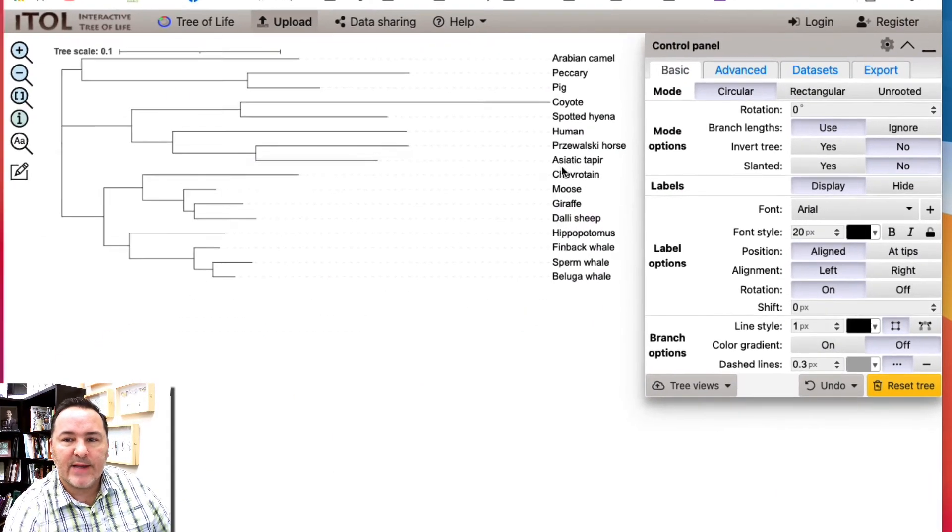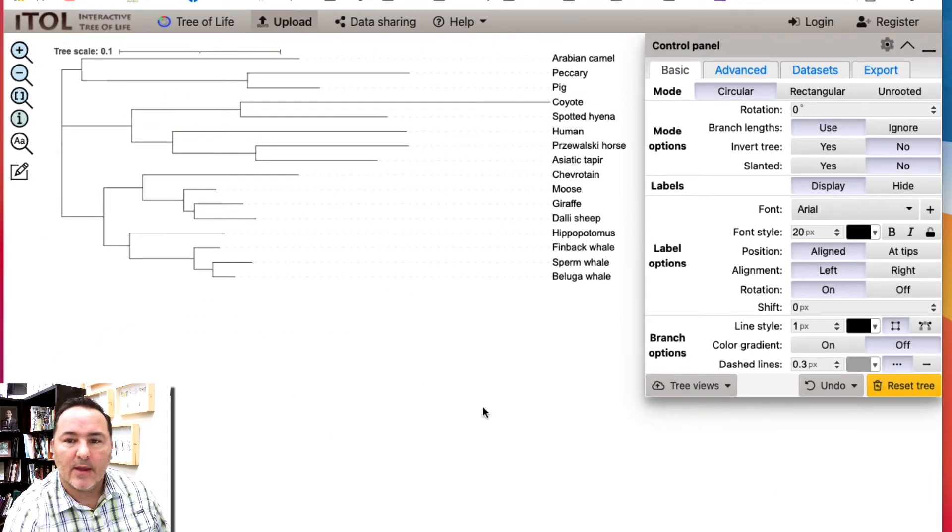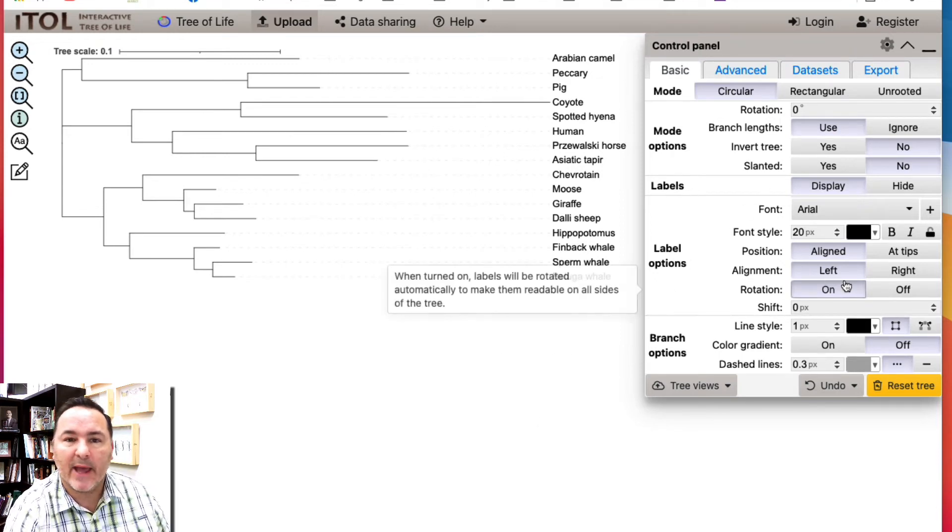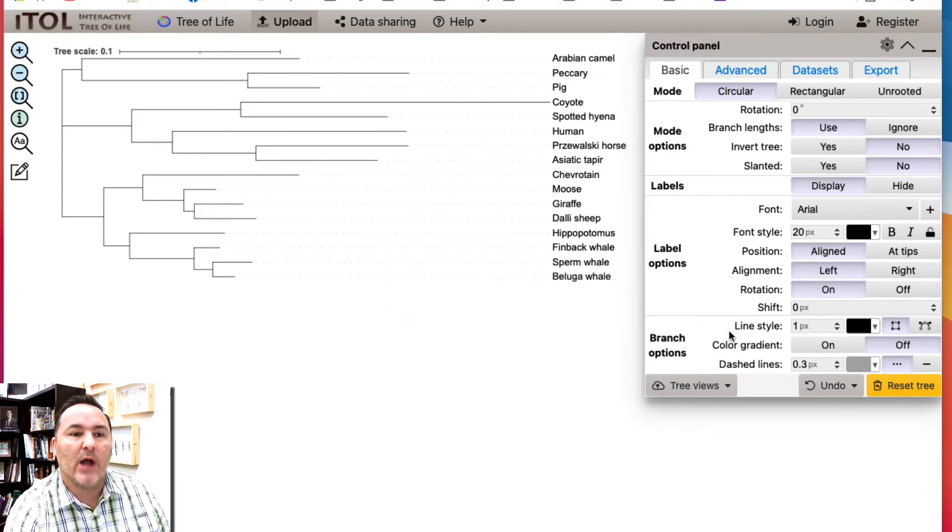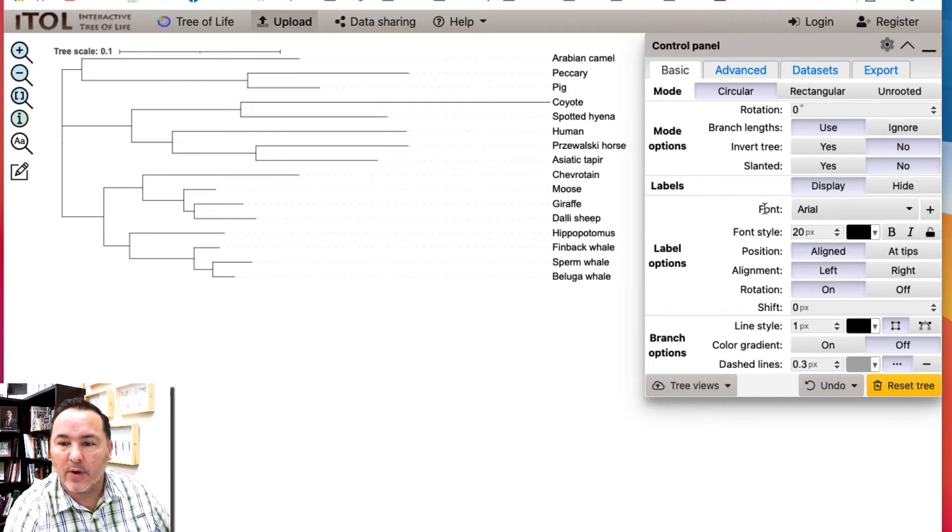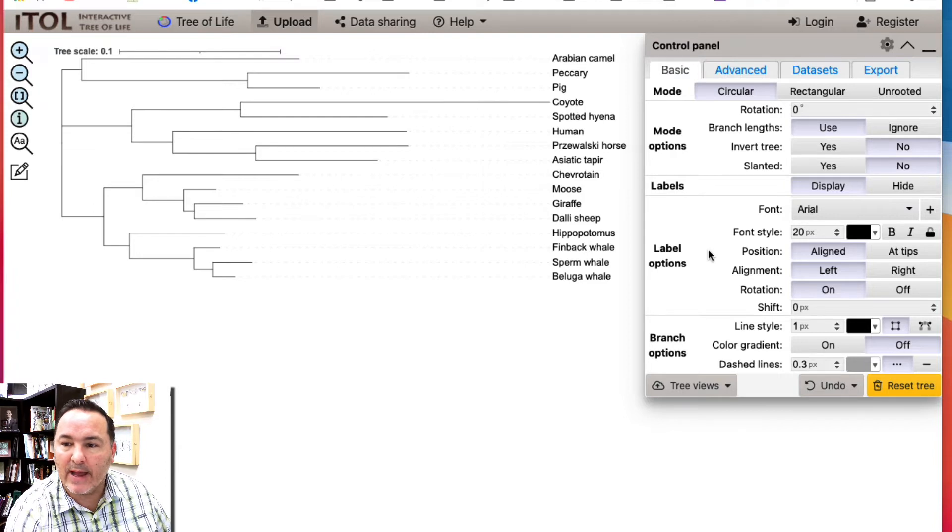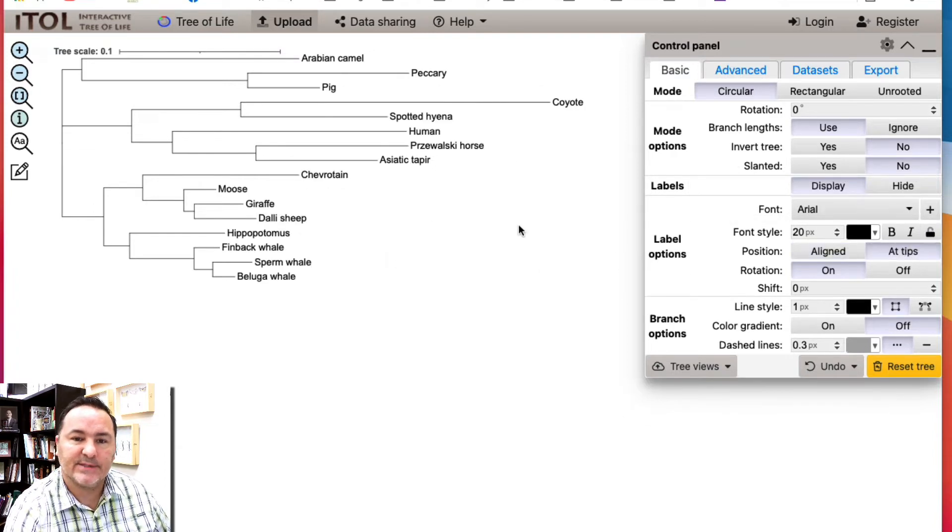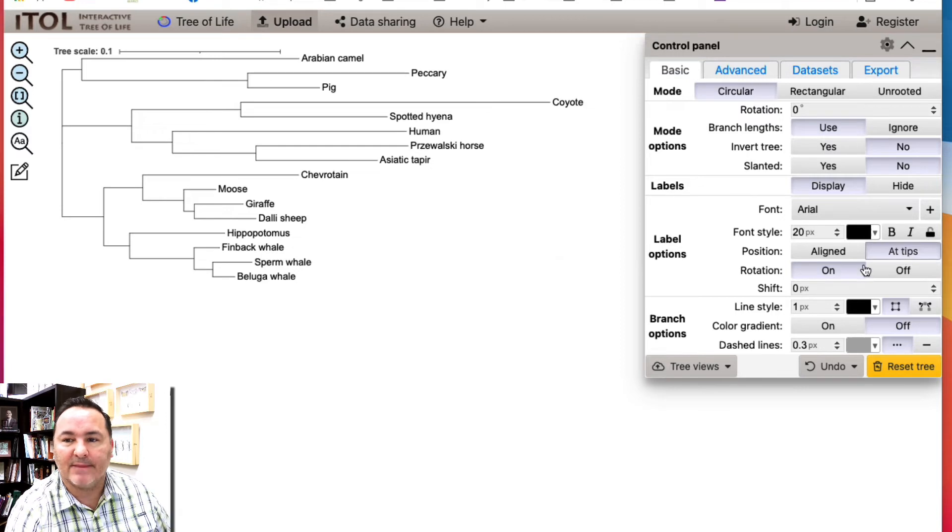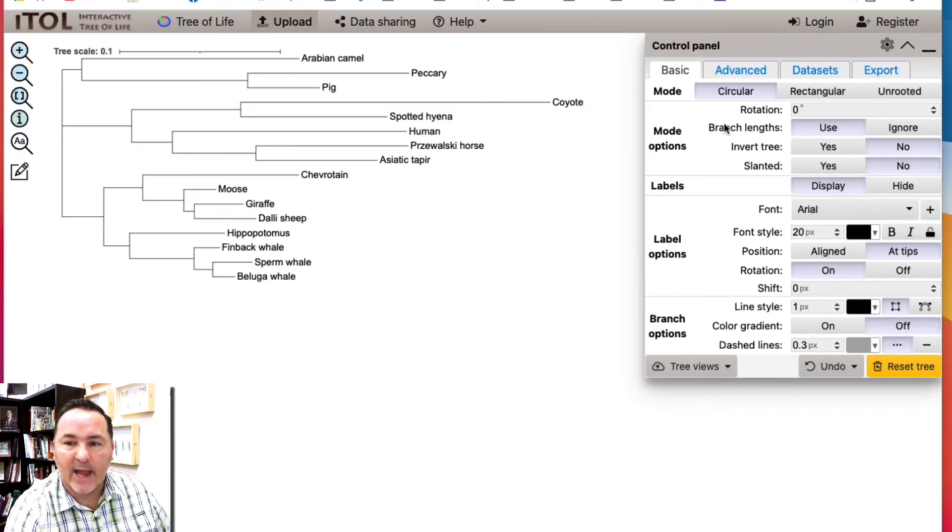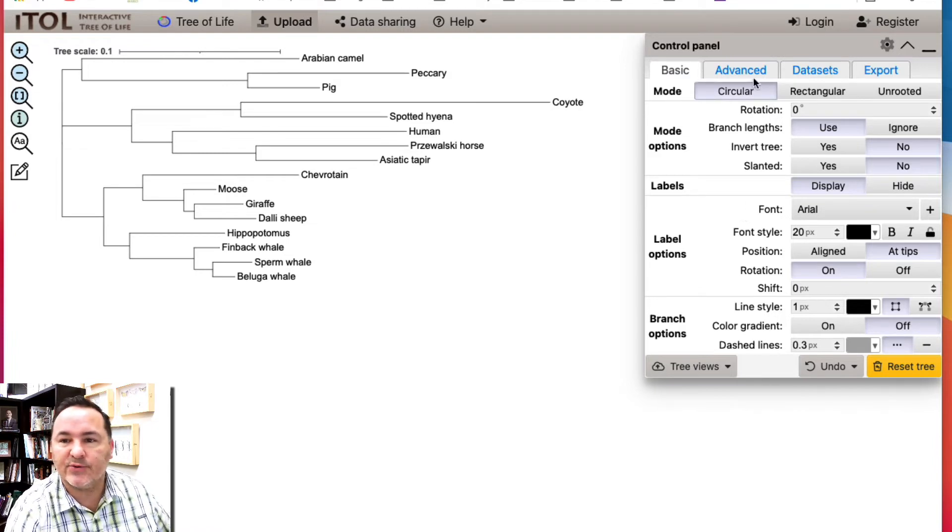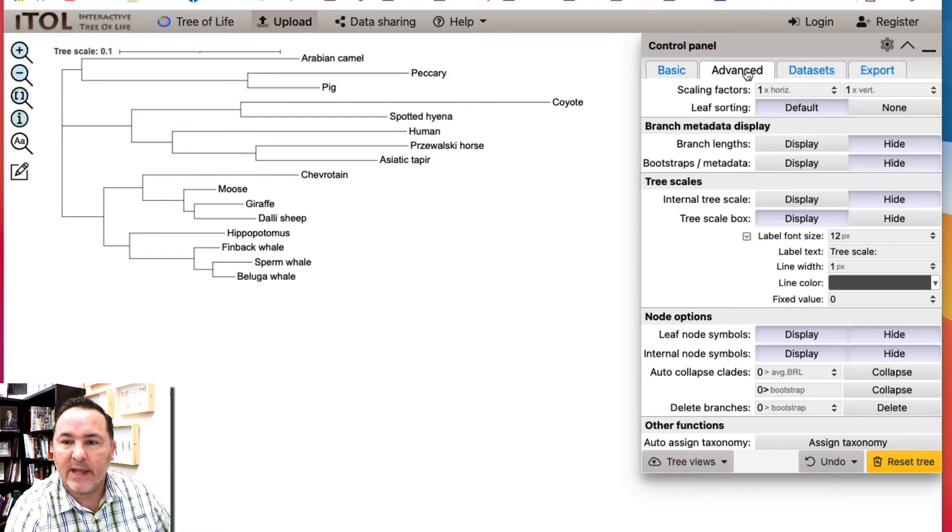Here we see now we have our tree and from here then you can use this control panel to do lots of different things that you want to do with your data. You might have to play around with this to get things right. For example, maybe I want my labels at the tips instead of at the very end, so I could click at the tips. I can change how big we want the text, how you want this tree being displayed.